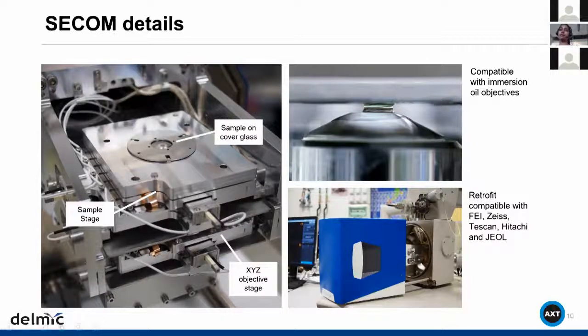This large base plate is the sample stage, which can move in X and Y. And here is the XYZ stage for moving the objective lens. The image here on the right shows you an objective lens with a droplet of oil in between the sample and the objective. So this system is compatible with immersion oil objectives, and it can be used in vacuum. And as I mentioned before, the SECOM is a retrofit compatible with a host of microscopes like FEI, ZEISS, Tescan, Hitachi, and JEOL.